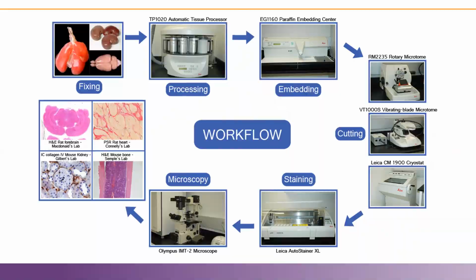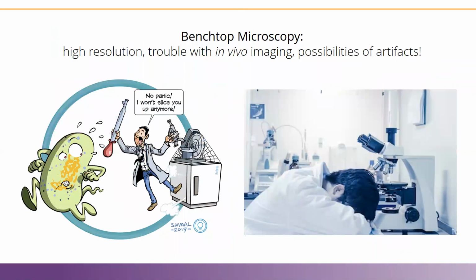So that's the reason why benchtop microscopy, though it is offering high resolution, the sample preparation is always tedious and also frustrating. During my PhD, I had to spend about 2 years with in vivo imaging. And many times my experiments failed because of the tissue preparation, there were some artifacts.